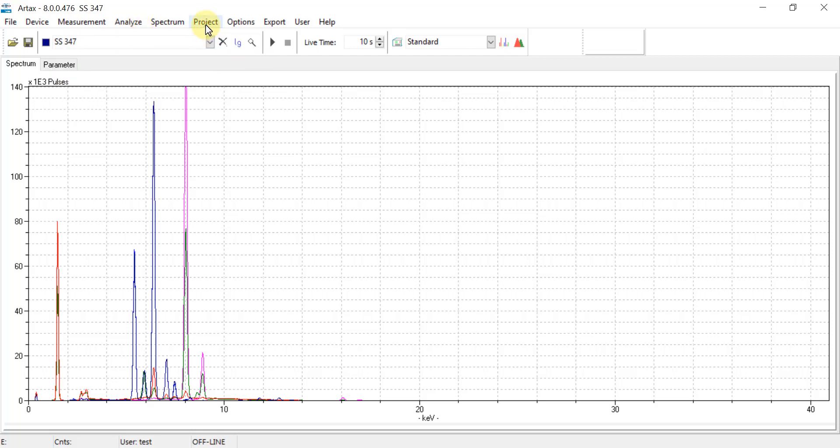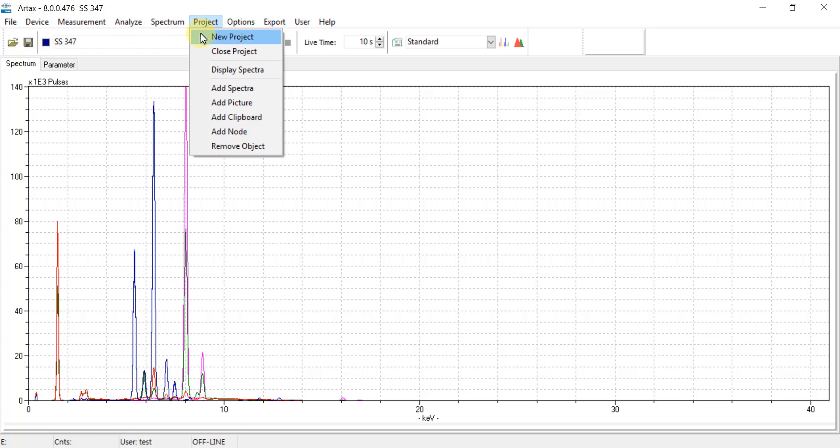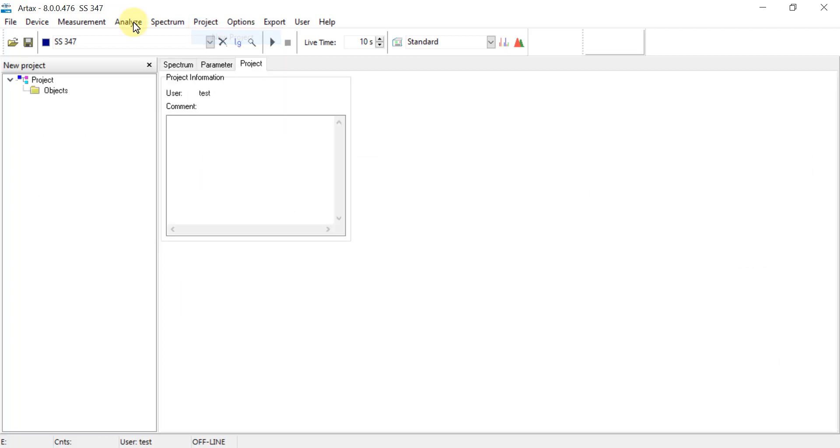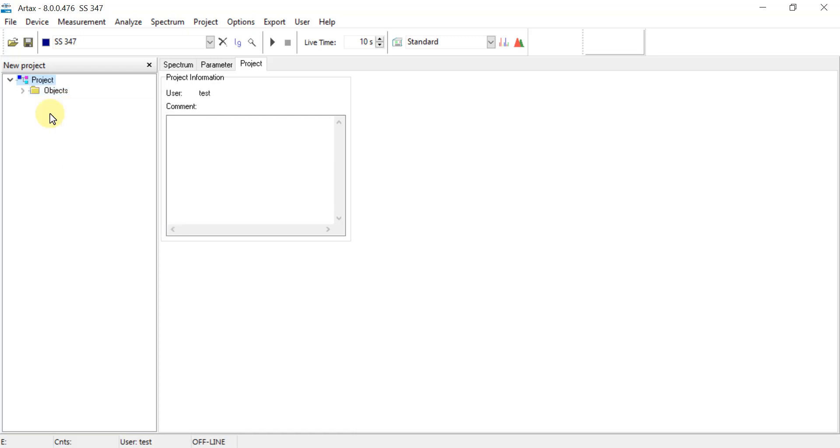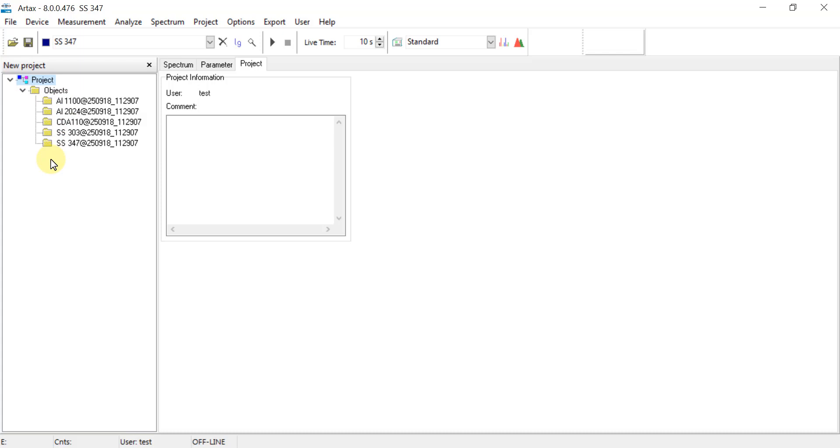From here, we go to the top menu and hit Project, and then select New Project. On the left side in the Objects folder, right click and select Add Spectra. Then we can hit this arrow icon, and it shows a dropdown that can confirm the PDZ files which have now been added to this library.